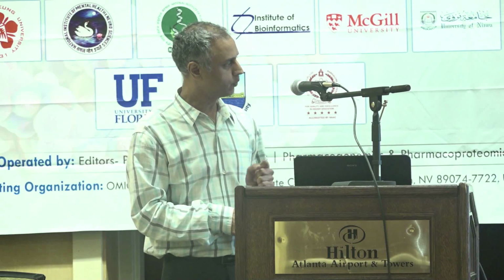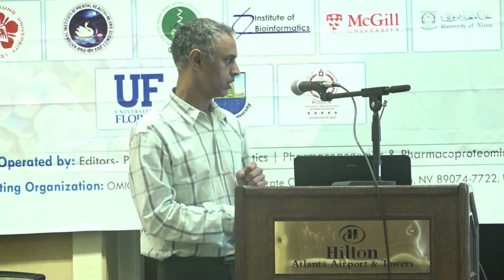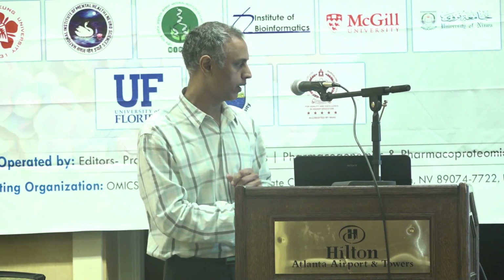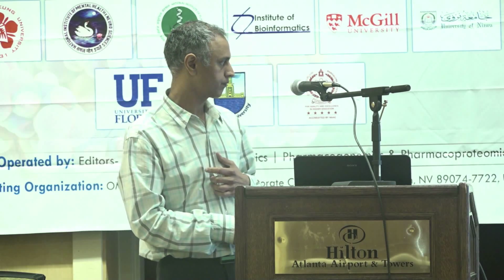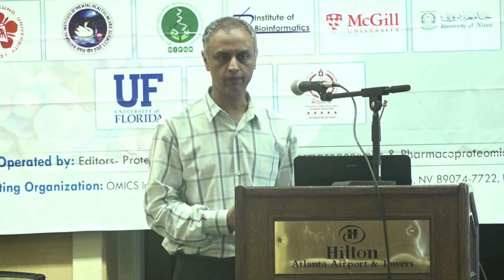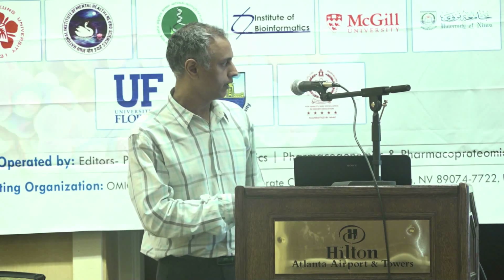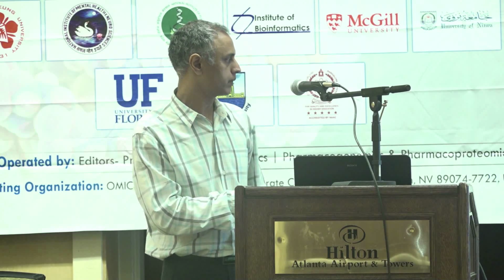And what we said was, let's look at them and see what genomics can tell us. So we have taken one isolate that is sensitive to all anti-TB drugs, and 9 with this discordance, and one non-tuberculous mycobacterium, Mycobacterium abscessus. And we did whole genome sequencing on the same platform. And again, we can take advantage of the fact that it's fast, it's cheap. We can do 10 different genomes in one run. And here, I will now show you what I meant by this genotype-phenotype discordance.